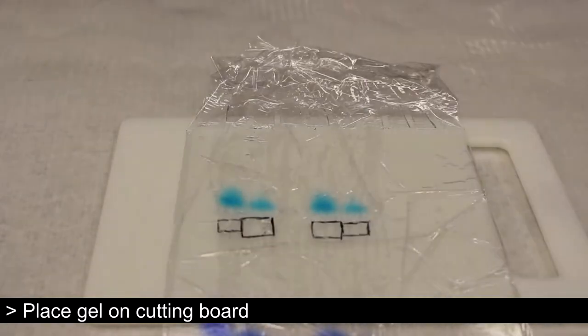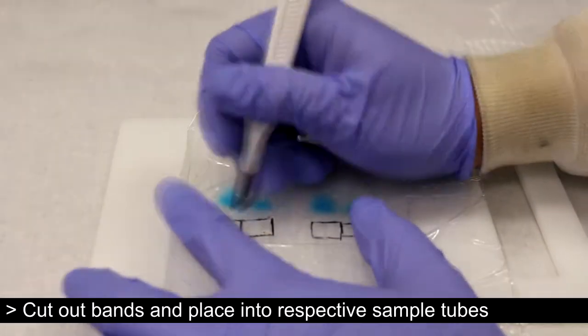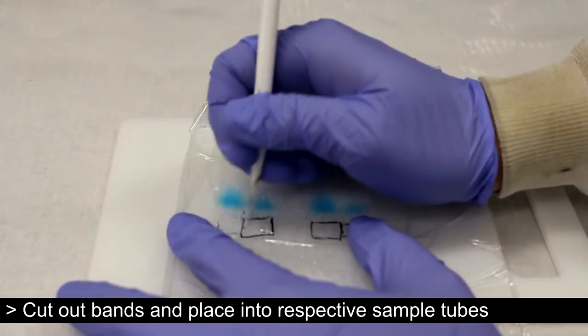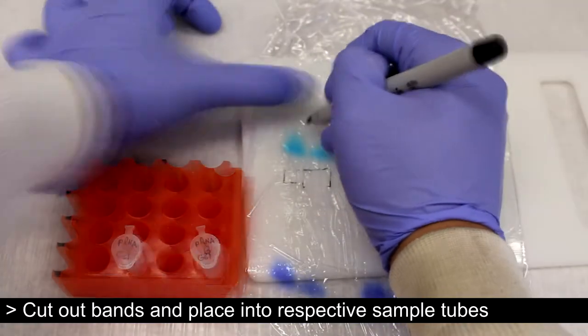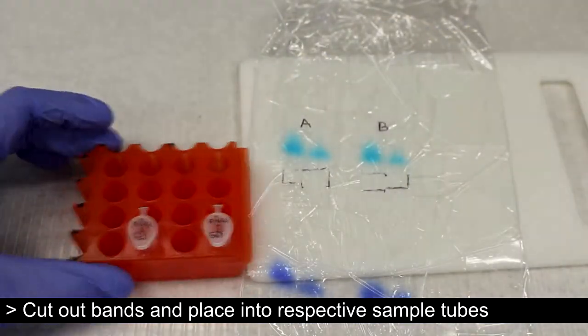The gel is then placed on a cutting board and the bands are cut out. The gel pieces are then placed into corresponding sample tubes.